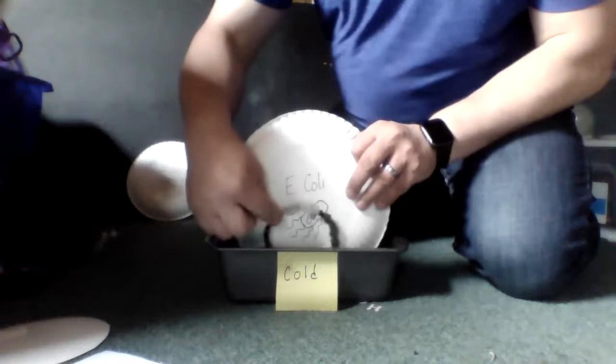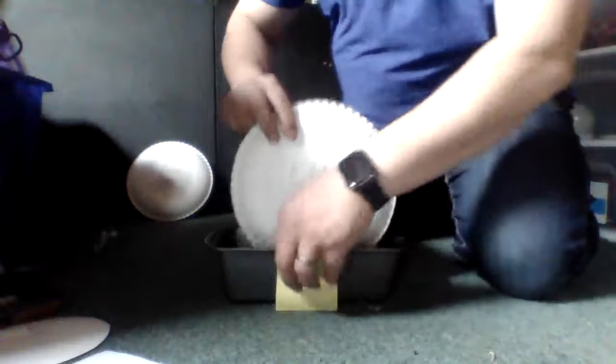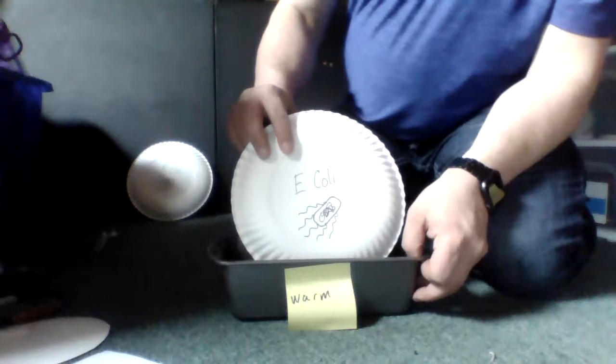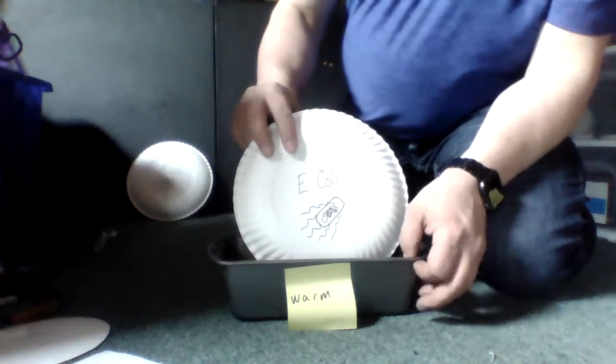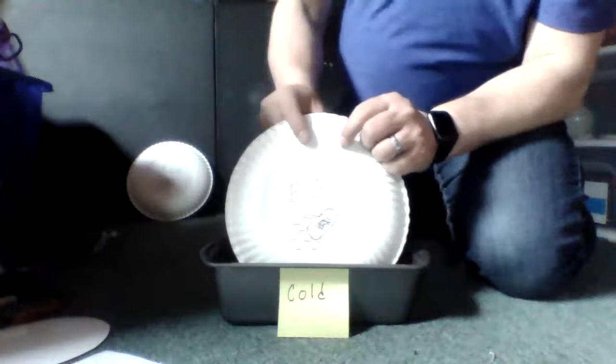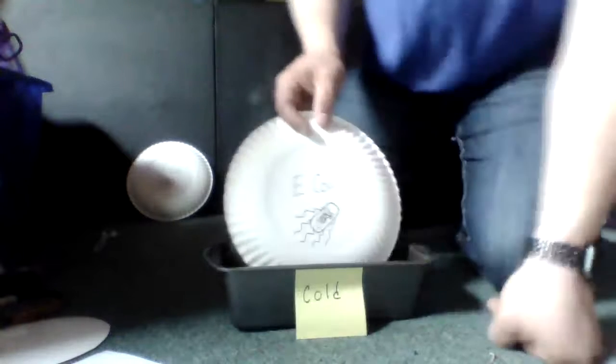So we add that plasmid, and then we do what they call a heat shock, which is basically taking out the E. coli and placing them back into a warm bath. We leave it in for about 50 seconds. Then we take that out and put it back into a cold one. Now, some of these are going to change and some of these are not. So we'll go ahead and get done with that.